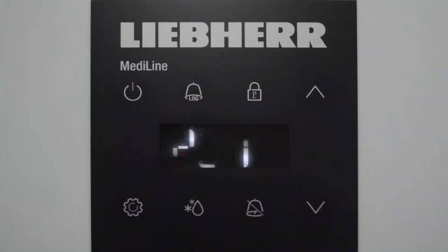And the last down is /T1, and that is to switch the temperature display between the control sensor, which is what comes with the device, and a product sensor, i.e. a secondary sensor you put in. So that would change the temperature readout from one sensor to the other. Again, that would only happen if you need to do that.